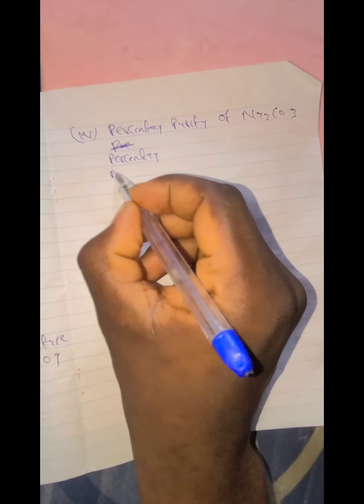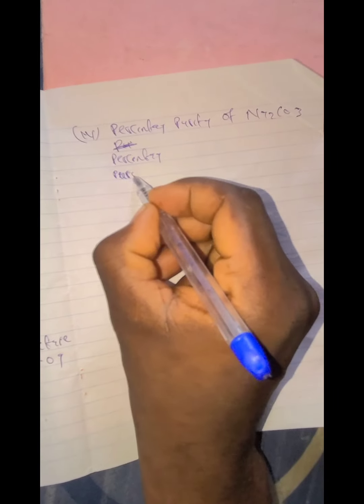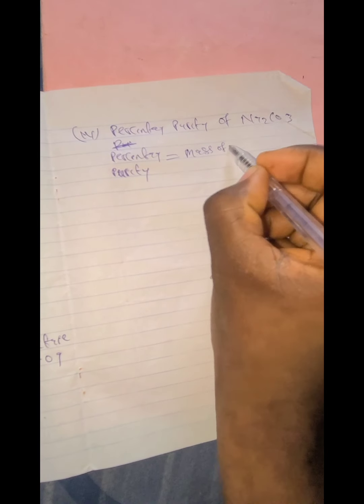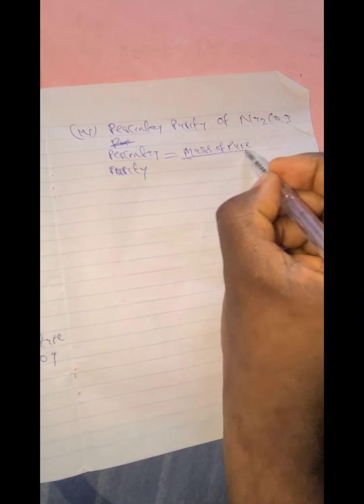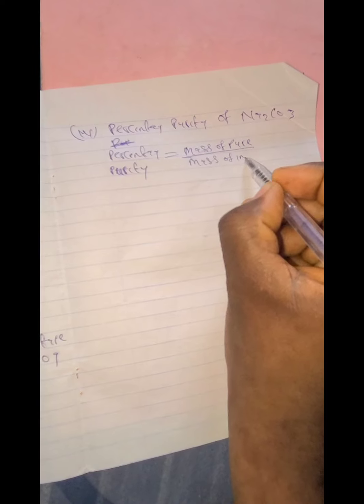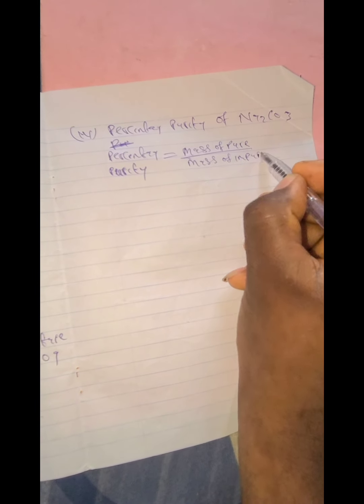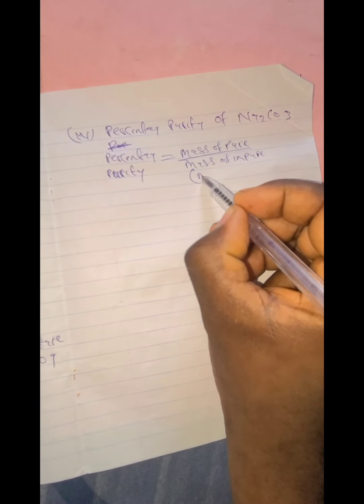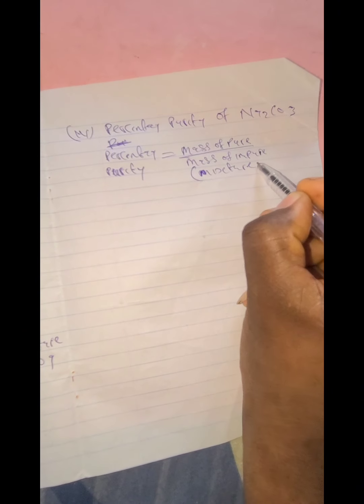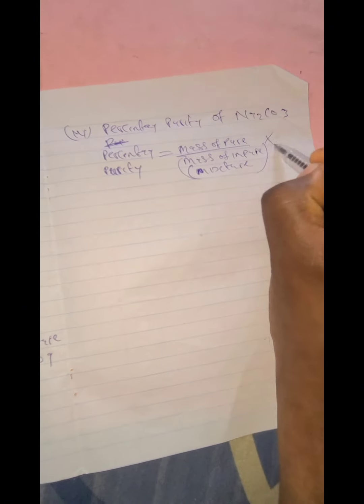Percentage purity is equals to mass of pure over mass of impure. I remember our mass of impure is the mass of the mixture. Okay, so that is the mass of impure. So times 100 over 1. That is percentage purity equals to mass of pure over mass of impure times 100 over 1.